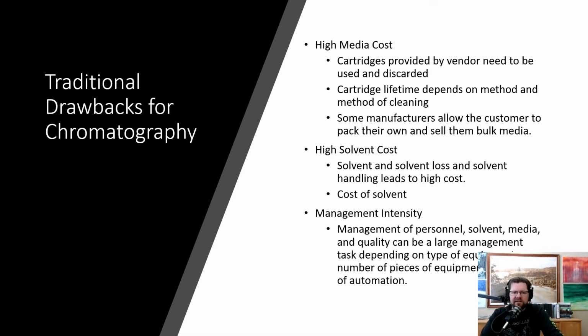Also, the high solvent cost, solvent and solvent loss and solvent handling leads to high cost, and then the cost of the solvent itself is very expensive. So this is a key issue associated with chromatography, is that high solvent cost. It's a really big problem. You're talking about lots of losses. You're talking about handling. You're talking about moving solvents. Even if it's somewhat automated, you have a lot of management intensity that goes on with that.